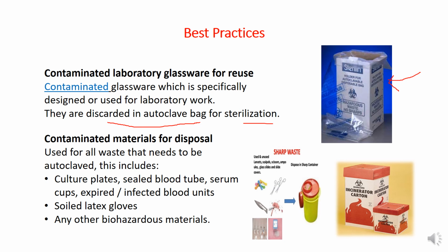here you can see these are the different special containers that are used especially in hospital labs as well as other areas where mostly sharps are used, and they are contaminated with blood samples, or from patients who have chronic diseases.